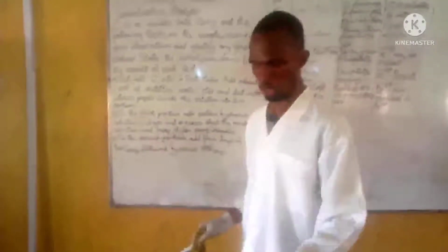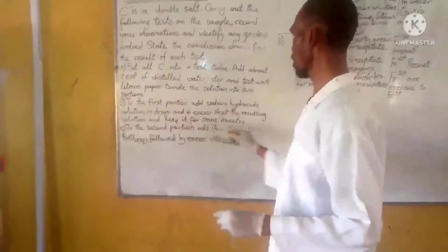So the second portion, add few drops of barium chloride. So this barium chloride solution, we add few drops.